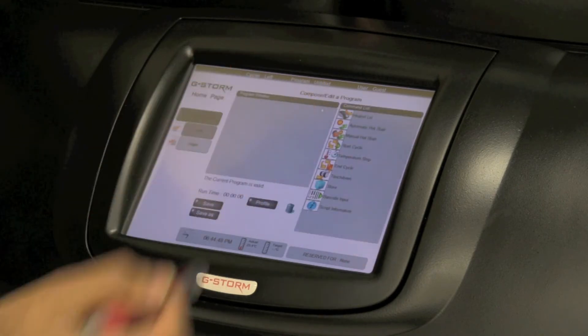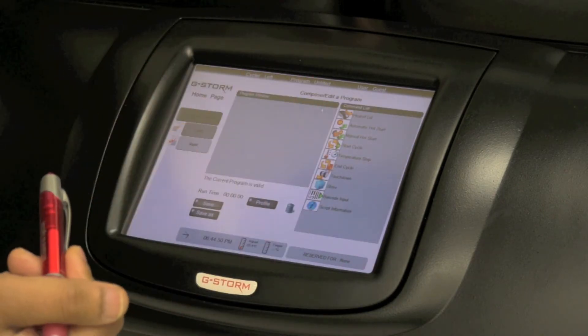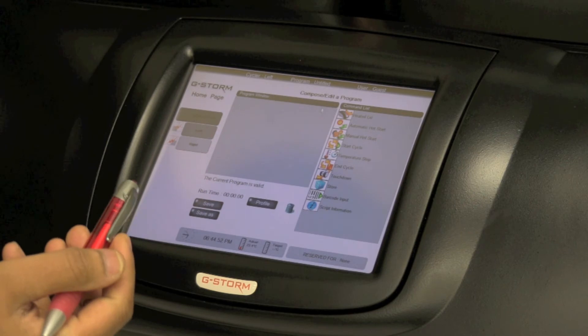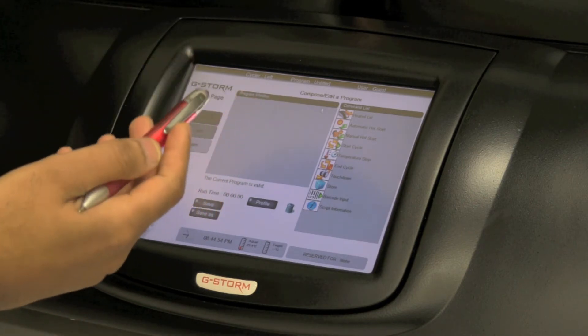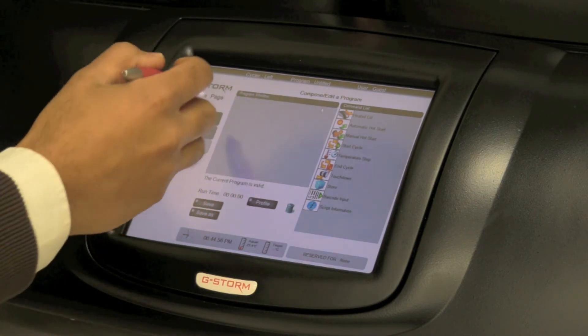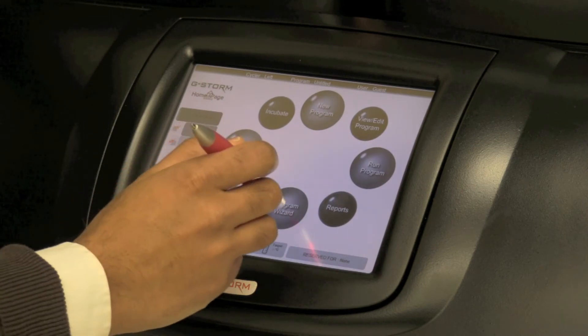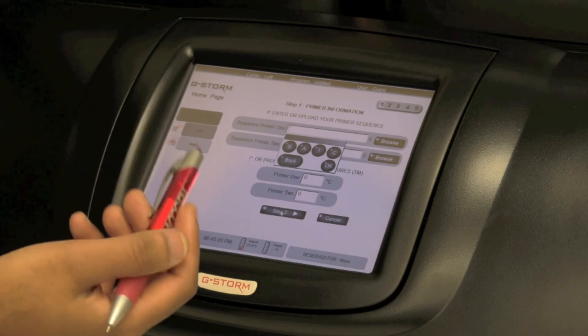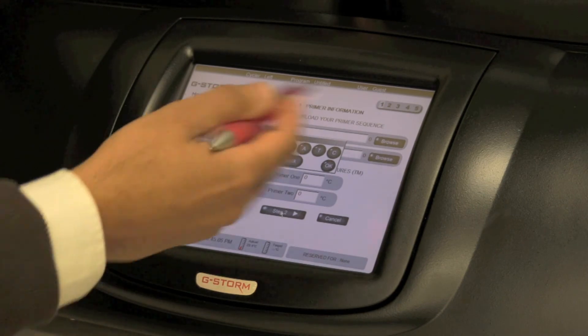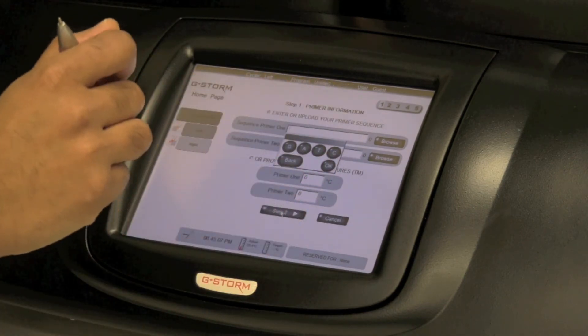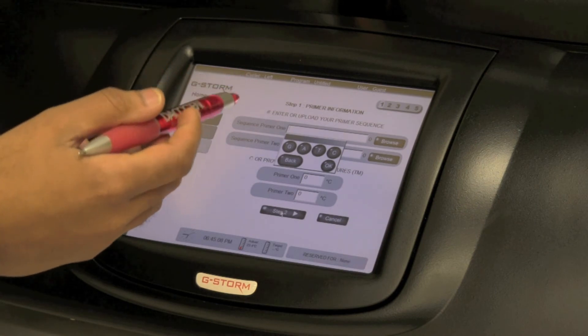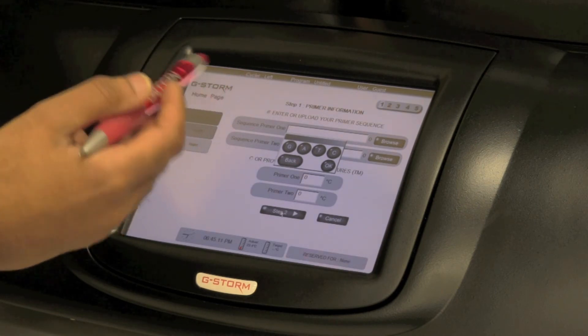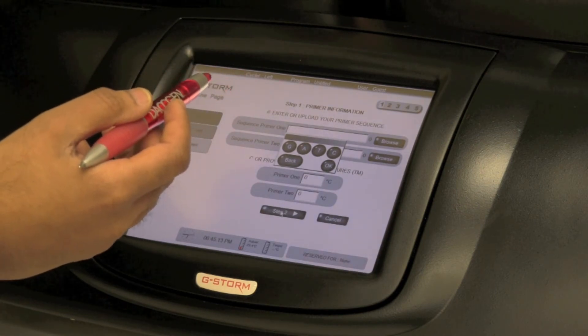If we click on new program for example, the G-Storm will begin to start to walk us through a number of logical steps that will help us achieve what we're trying to gain. Something that makes things even simpler is the program wizard. Now with the program wizard, all you need to do is literally enter a number of very simple parameters. The G-Storm will then perform a number of calculations for you and help you achieve your procedure in just a few simple clicks.